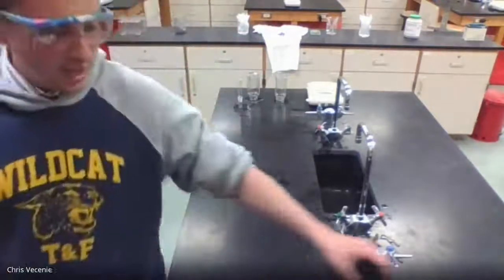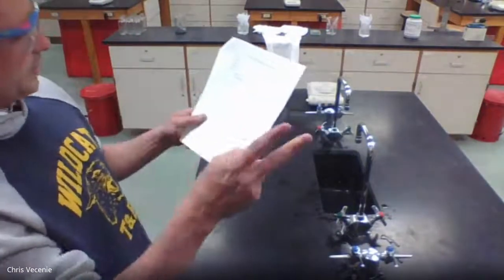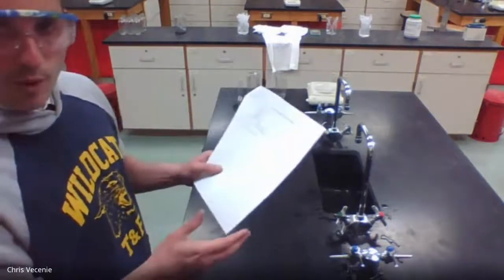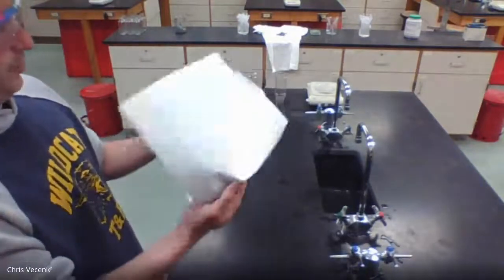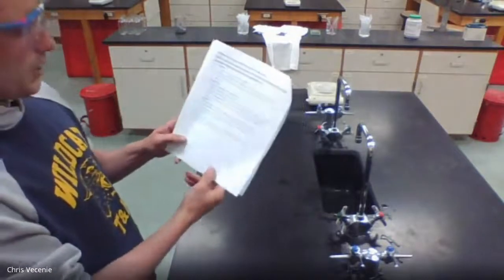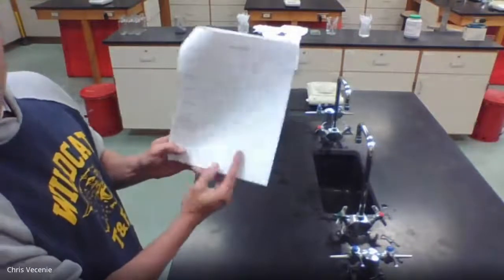to do our test. All right, so for you guys, hopefully by this point you have your title, your purpose, your materials, and your five-part conclusion almost done. Can't conclude till the very end, but you can do those first couple. We're heading into our data table. And the tests are described here. I'll walk you through those. And your data tables are back here.